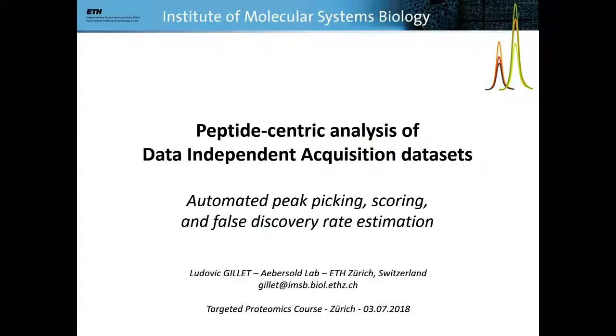And what you've also seen a couple of times in the last days, maybe some score distribution plots. You've heard people mention mProphet and so on, but we haven't really gone into a lot of detail about what this means, how the data are extracted and scored, and how eventually the errors are estimated. So Ludovic is going to start with this, mostly on the scoring, and then Isabel will take over afterwards and talk about FDR and alignment and things like this.